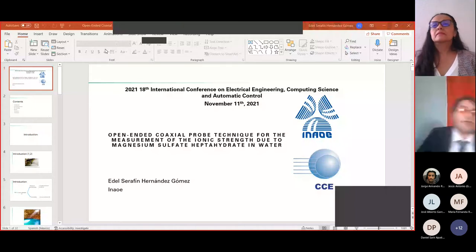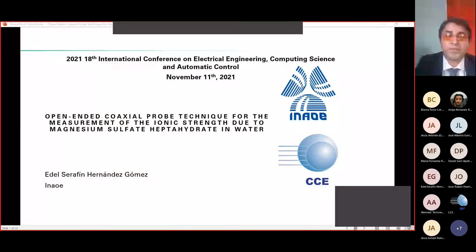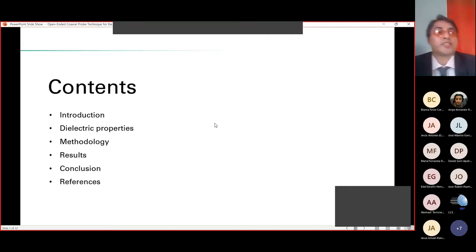Good afternoon. My name is Edel Serafin Hernandez Gomez, and I will present the topic Open-Ended Coaxial Probe Technique for the Measurement of the Ionic Strength Due to Magnesium Sulfate Heptahydrate in Water. The presentation is divided as follows: introduction, dielectric properties, methodology, results, conclusion, and references.